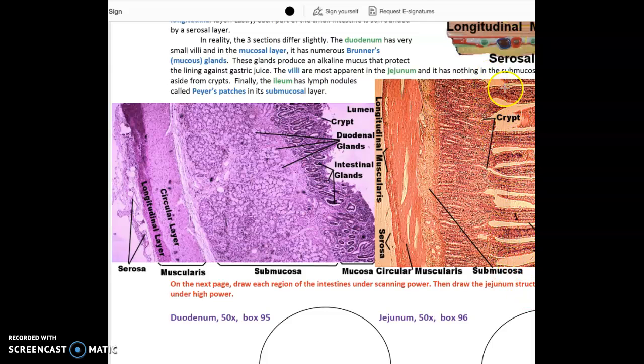This is all the mucosa in here. This is the submucosa. Here's the circular muscularis. Here's the longitudinal. Here's the serosa. This actually is a nice view of the serosa. It's actually distinct.